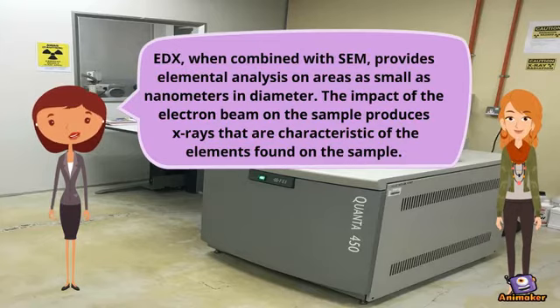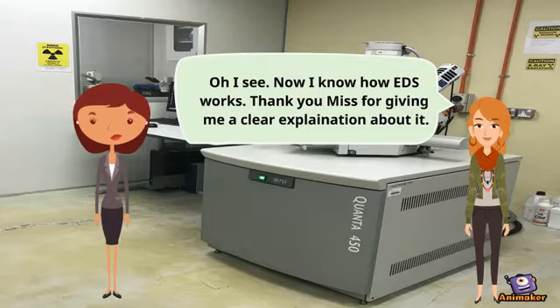EDX, when combined with SEM, provides elemental analysis on areas as small as nanometers in diameter. The impact of the electron beam on the sample produces X-rays that are characteristic of the elements found in the sample. Oh, I see. Now I know how EDS works.